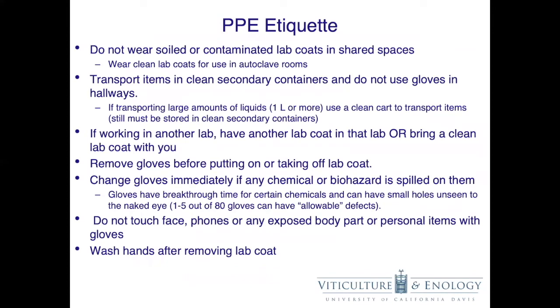I would also like to discuss some PPE etiquette. Do not wear soiled or contaminated lab coats in shared or public spaces. This is true for both chemical and biological contamination. Wear clean lab coats for use in autoclave rooms. Do not eat or drink in your lab coats. Unfortunately, I've seen too many people in these buildings do this. I know not many of you will be working with hazardous materials. This is still something that should be abided by for the same reason that you should not eat or drink in your lab.